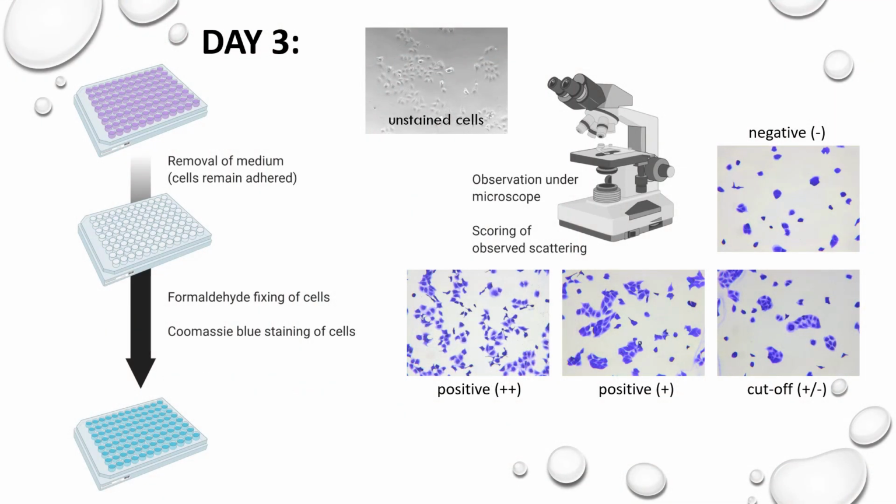This is the day in which you're going to see the result of your hard work of the last 2 days. All the tedious pipetting, the dilutions you did yesterday, and the cell seeding the day before. Today we're going to see the results of that effort. And therefore, let's not wait any longer. Get your plate from the incubator and place it under the microscope. And what do you see?